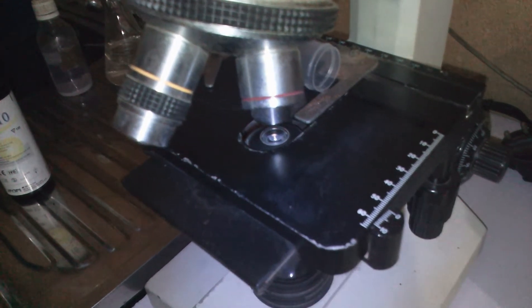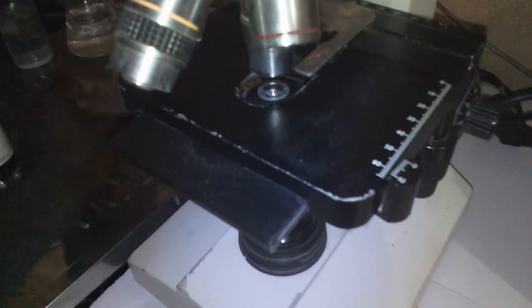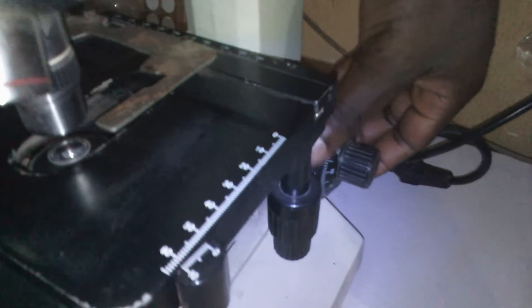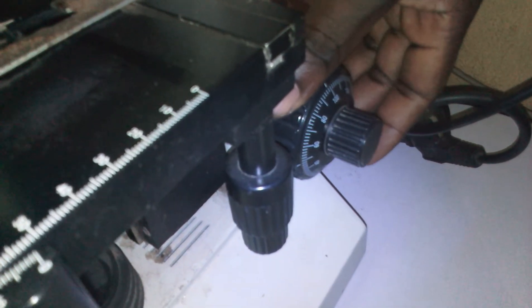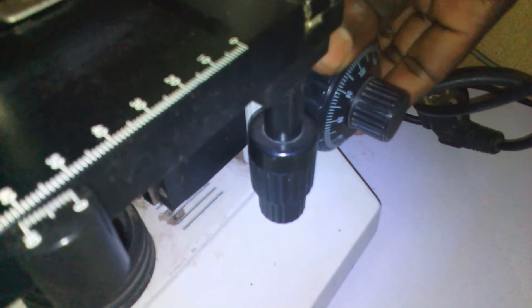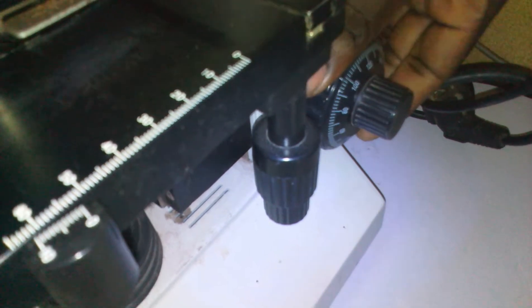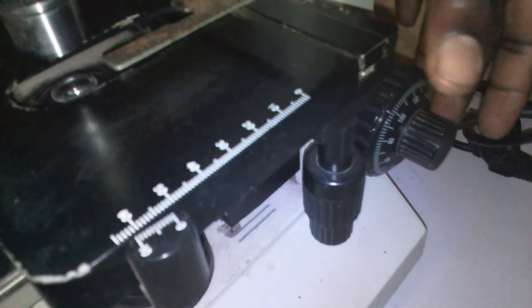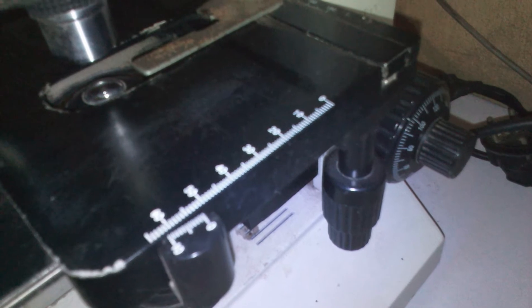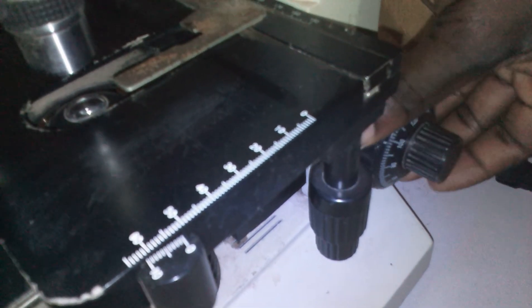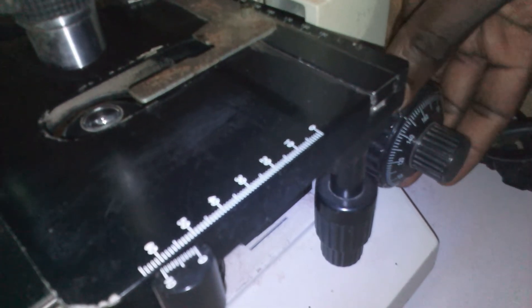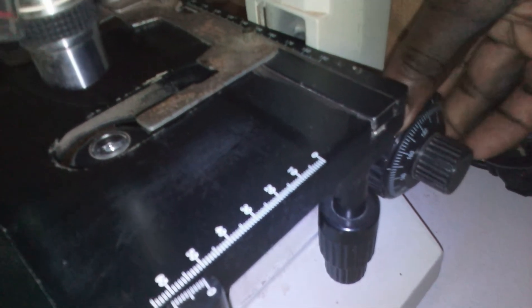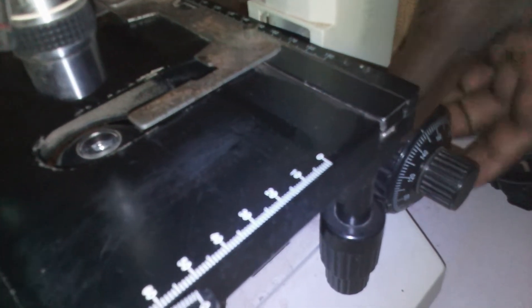This one is called coarse adjustment. This big one is called coarse adjustment. It's used to move up and down the stage. You can see as I'm rolling it, it is going down. If I roll it up, it's coming up.